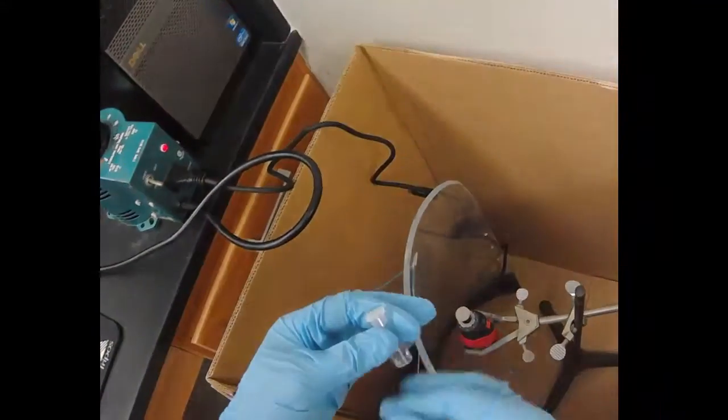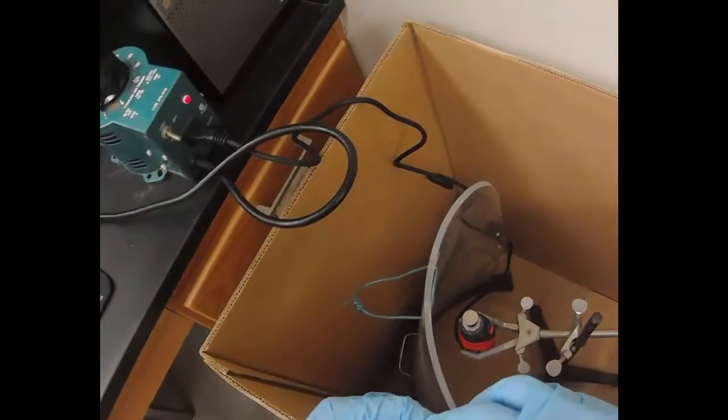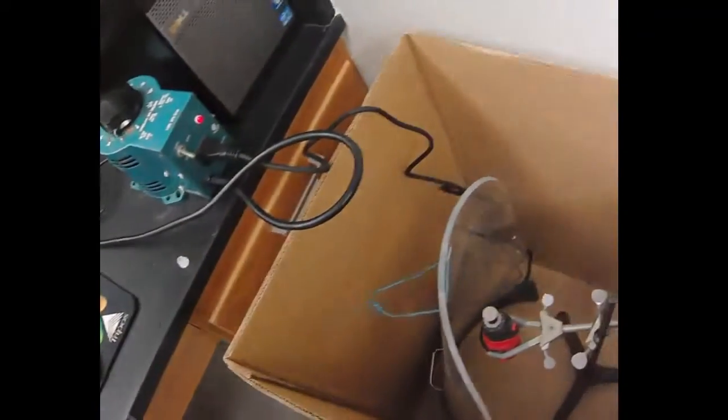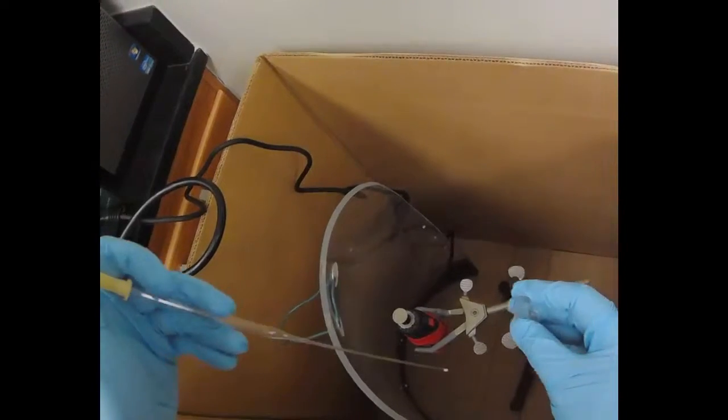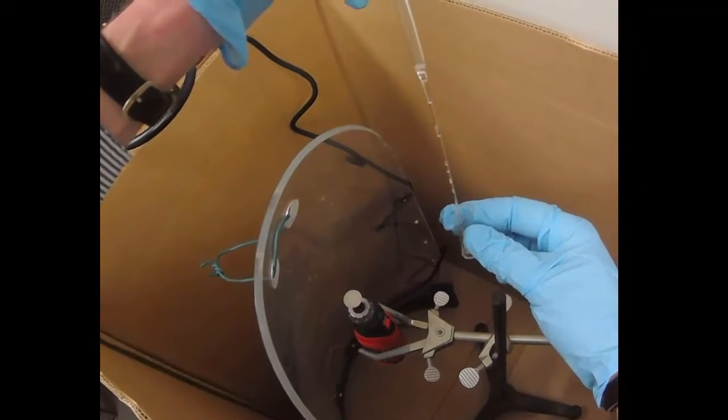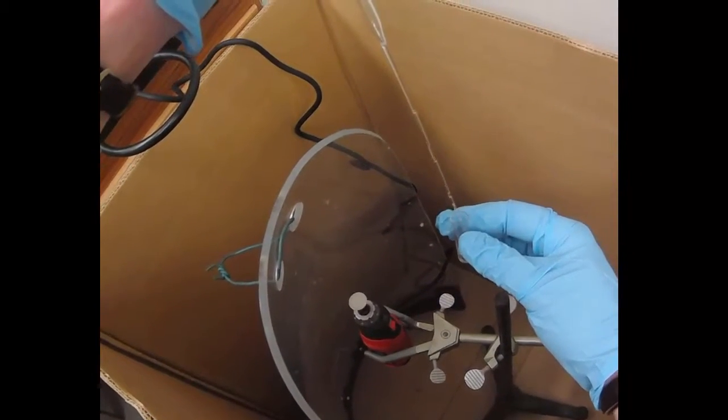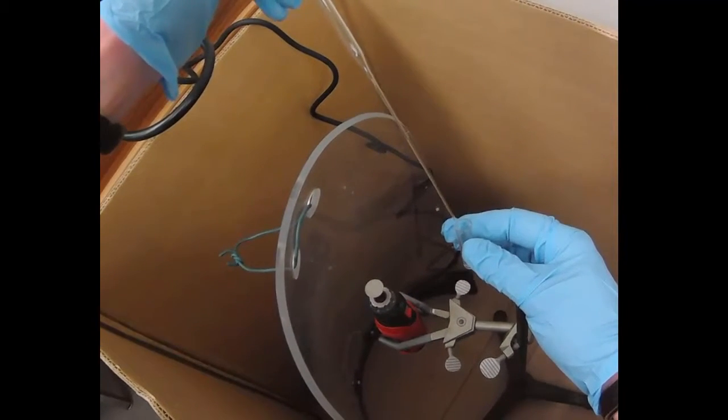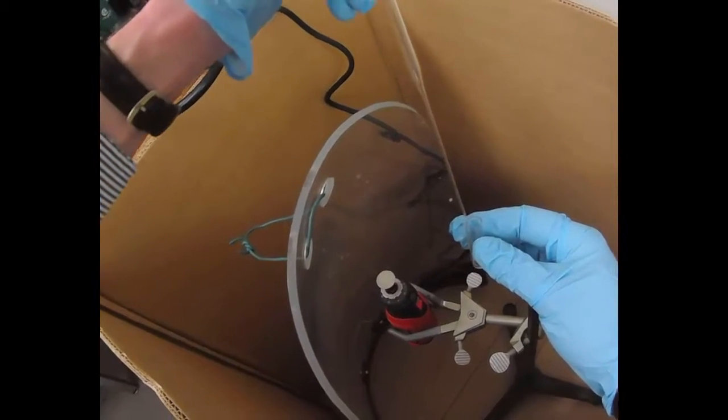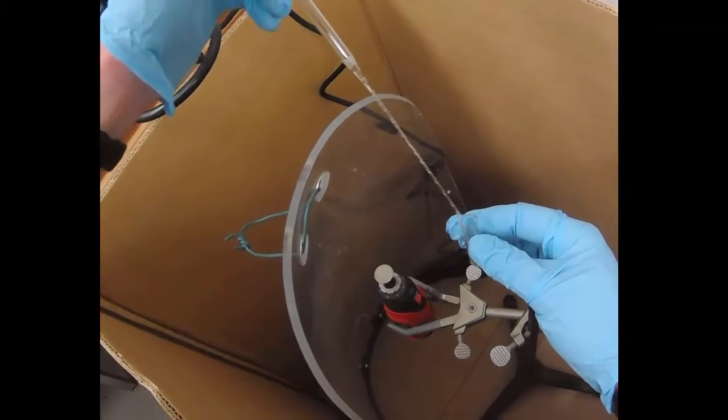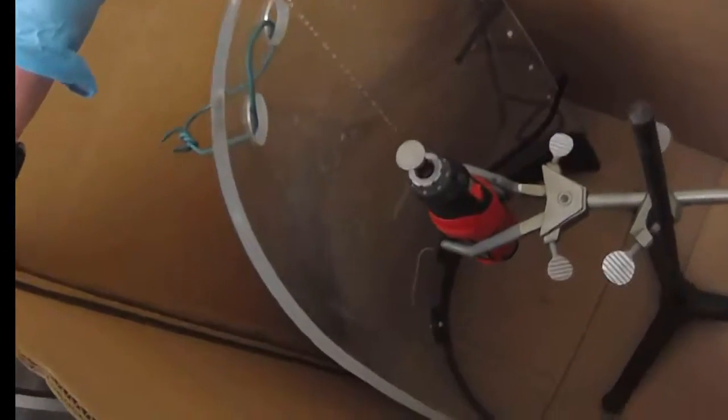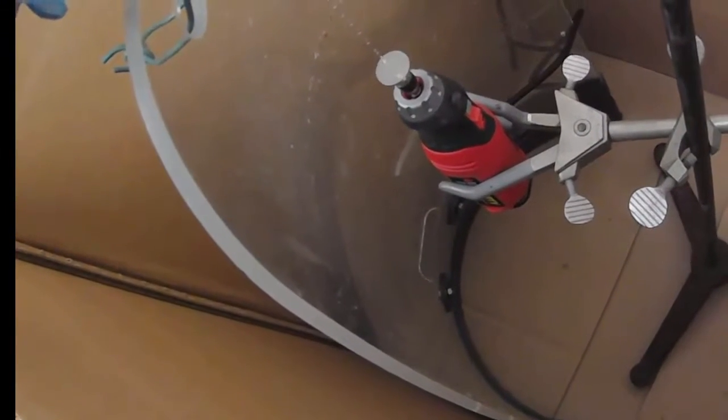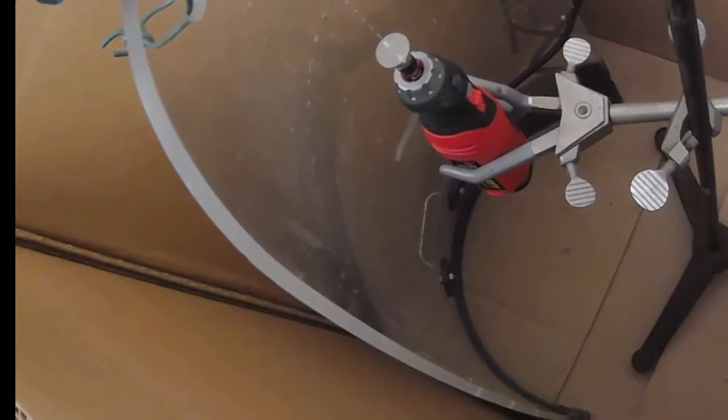Now we take our solution with our polymer in it. And we're going to place a few drops into the center of the spinning disc. So we don't want to touch the glass. Just add a couple drops to the center.